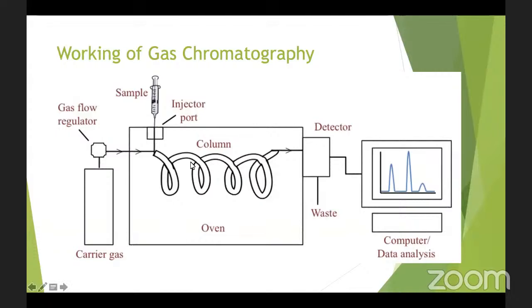That is the place where the sample mixes with the mobile phase. I think you are talking about this place here, in the corner. Yes, that is the place where the sample gets mixed with the gaseous mobile phase that is coming.